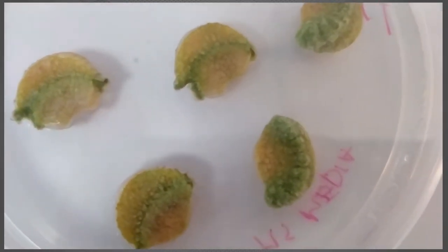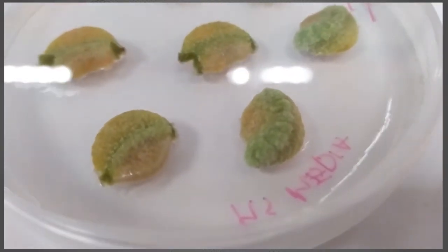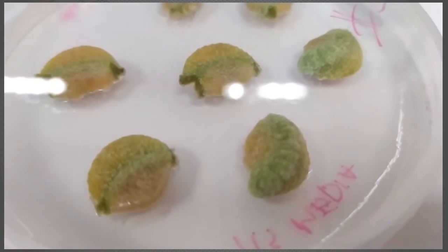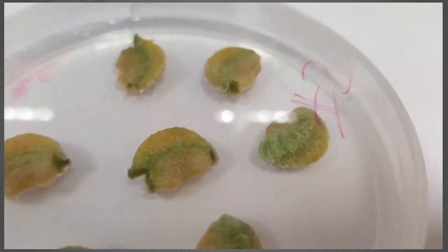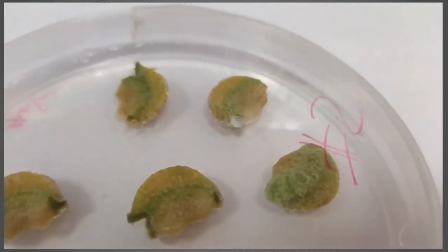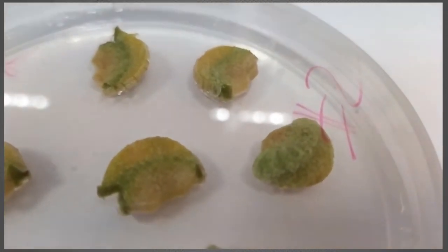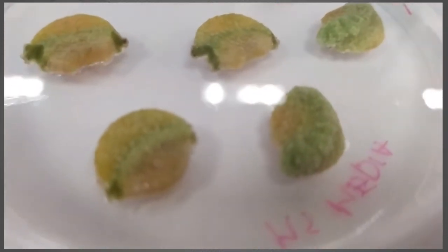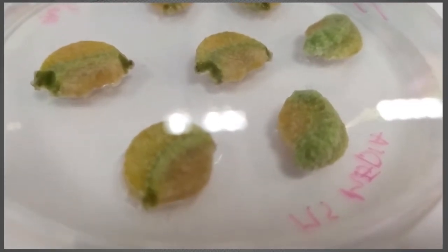What you're seeing here, especially this one right there, is a fairly thick layer after 4 or 5 weeks of growing. There's actually a fairly thick green callus. You can see there's been growth in many cases on these — here is a very obvious one. We have a fairly significant amount of growth of these undifferentiated cells.